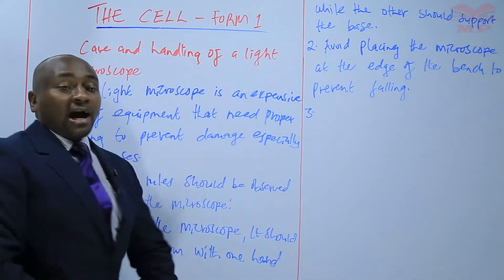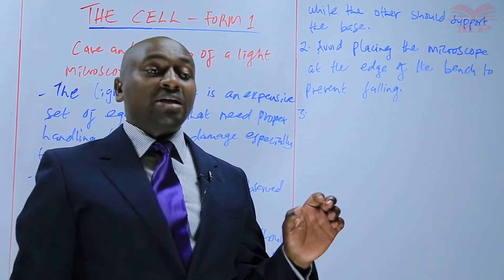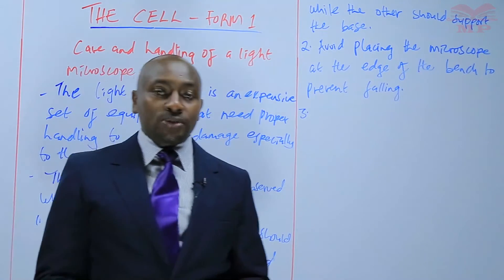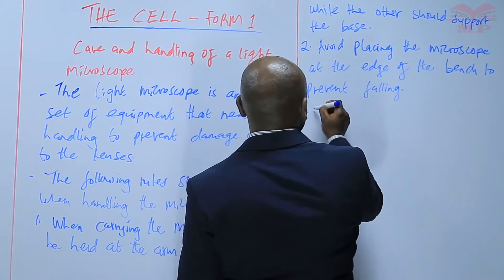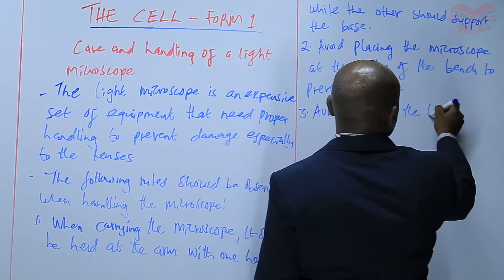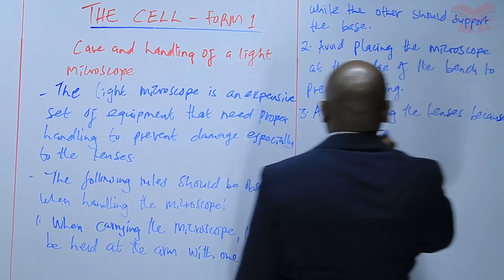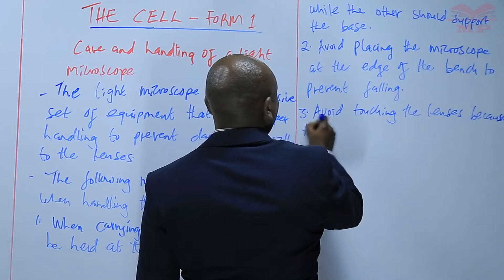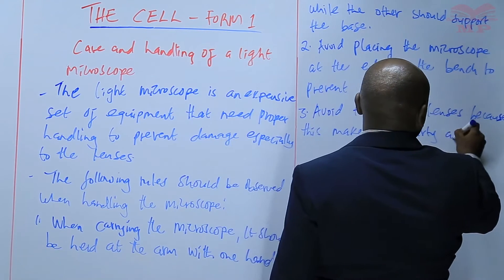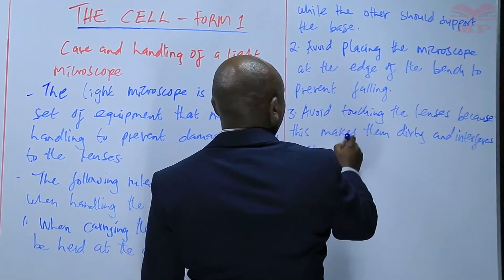Number three: avoid touching the lenses. Avoid touching the lenses because once they become dirty and stained, they interfere with what one is able to view using the microscope. Touching the lenses makes them dirty and interferes with visibility.